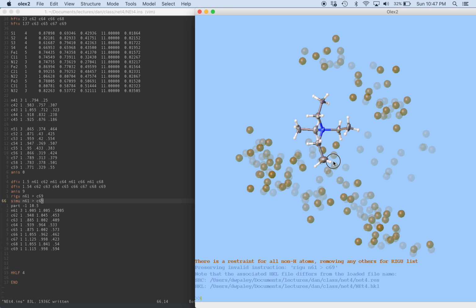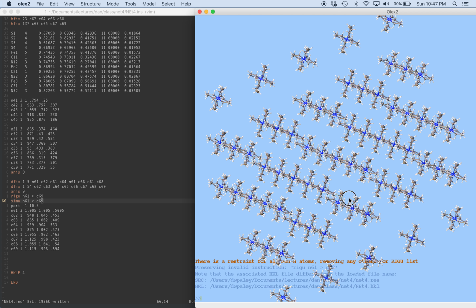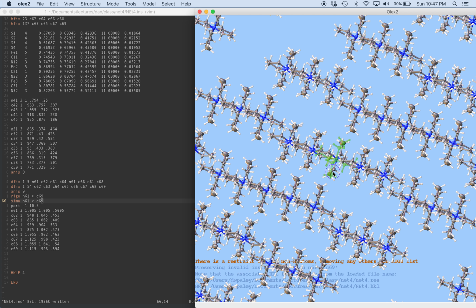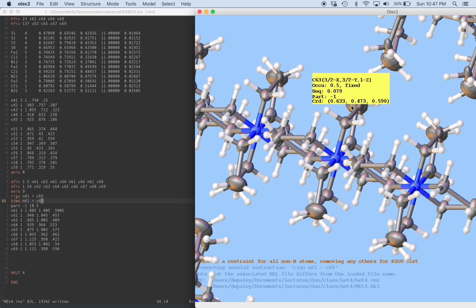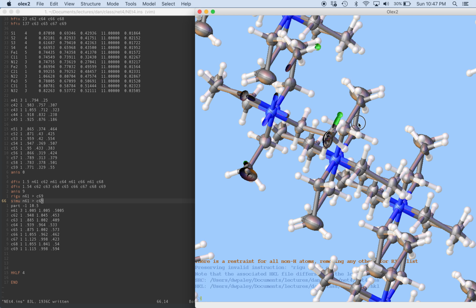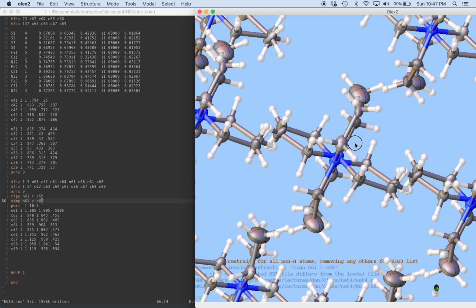You know, here's another thought actually. Depending on the type of symmetry element that this is sitting on, we may... oh, not that. This is on an inversion center. So that means that these overlapping pairs of atoms are inversion related.